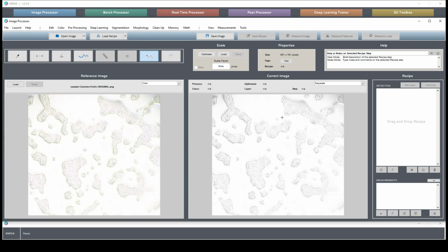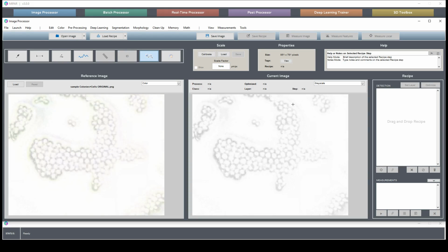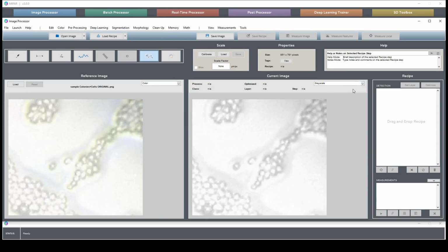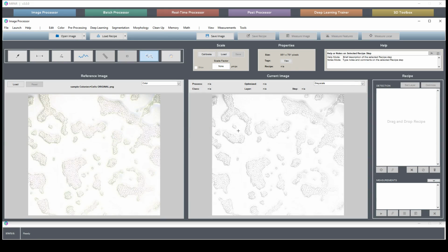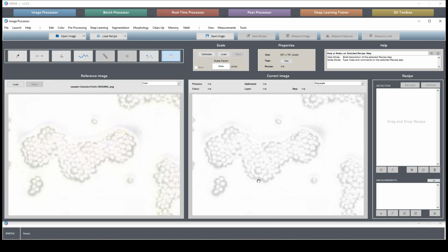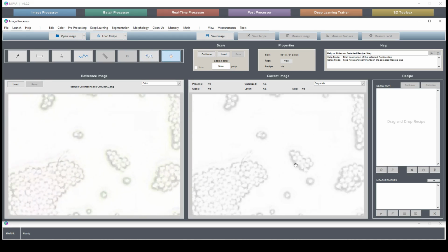And then we'll have to do some adjustments to make sure that we get a reasonable segmentation here in the bright portions and in the dim portions. We also have this haloing that's going on around our colonies, and these are going to cause some issues for us as well.